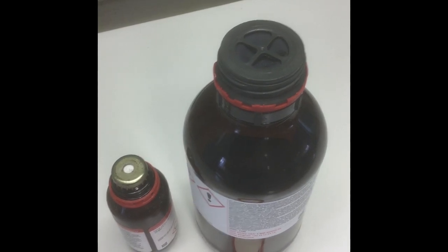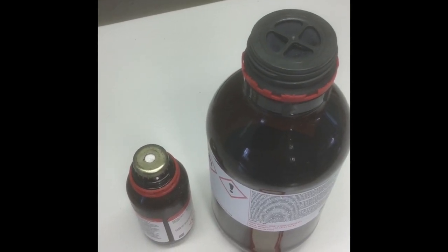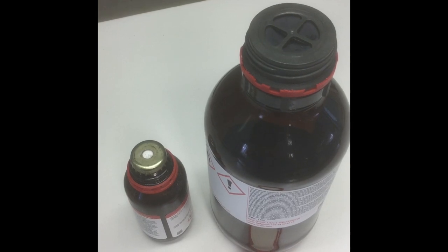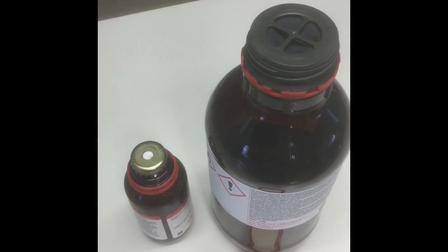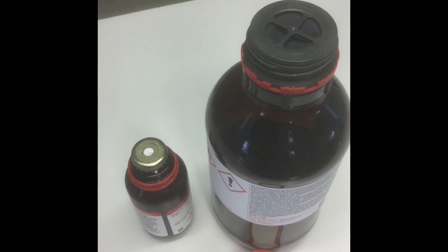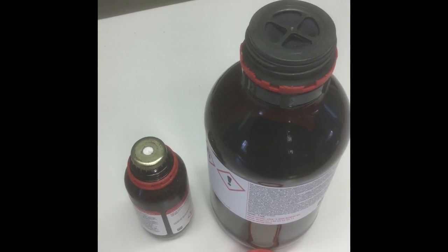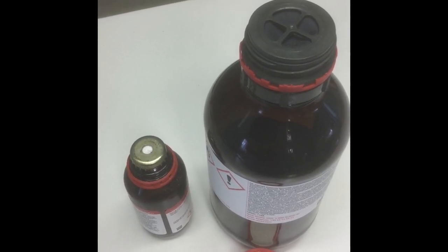Here are some examples of reagent bottles which contain air-sensitive material. These have special seals incorporated in the bottle which must not be removed. The area to insert a needle can clearly be seen.